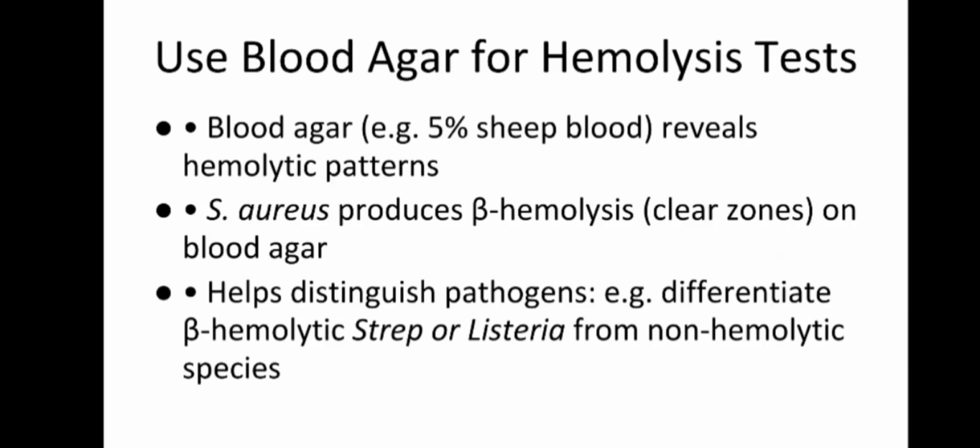In this case, the 5% sheep blood, when you add it to a media, you will add it in a condition that is suitable for the blood. Means you will not heat it. As soon as you bring the agar mold out of the autoclave, we will not add this sheep blood, right?